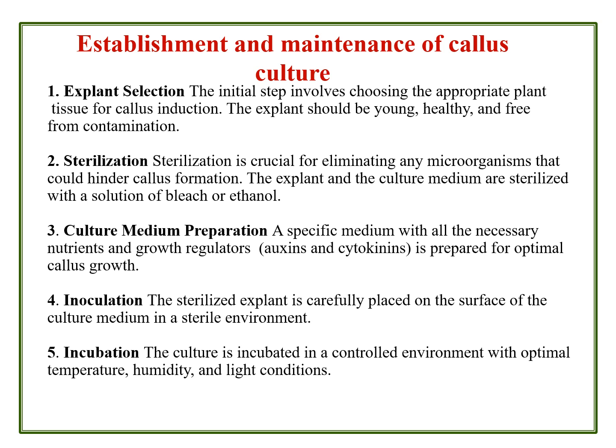So that's why, while you are incubating the culture, make sure the environment is controlled. Checking the temperature must always be 25 degrees centigrade plus or minus, with a relative humidity of 75 to 85 percent maintained, and the photoperiod. Since it is a callus culture, the photoperiod comprises a 16-hour dark period and an 8-hour light period.